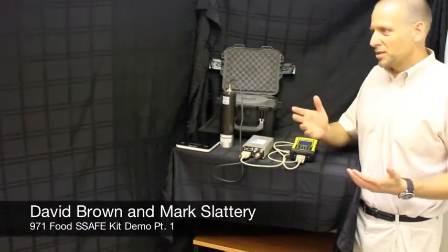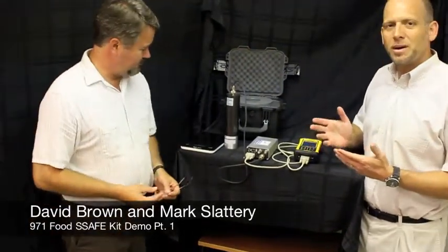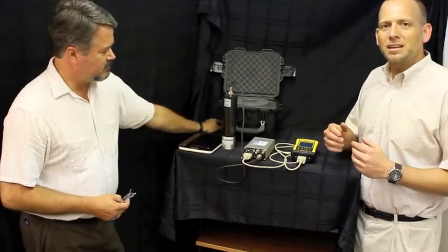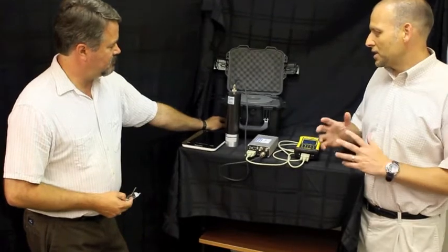I'm David Brown and I'm joined here with Mark Slattery from Berkeley Nucleonics. Today we're introducing a new system, the Model 971 Food Safe spectra and sample analysis and food examination kit.